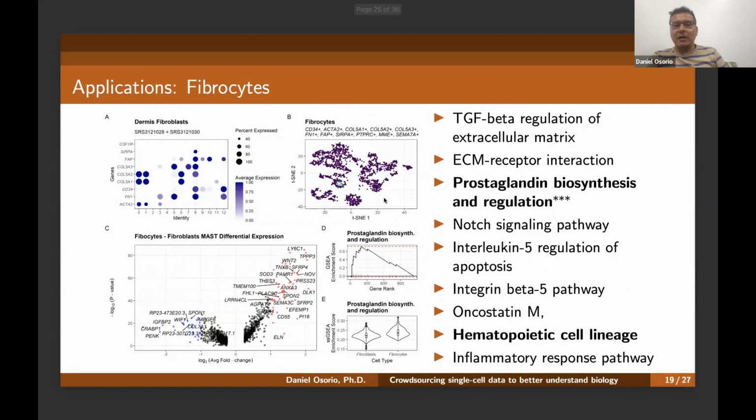And what we found is that there was a cluster, cluster 8, that after pooling the 2 data sets with fibroblasts exhibiting that specific set of genes, is enriched with them. So cluster 8, in comparison with all the other clusters of fibroblasts from skin, is exhibiting the genes I'm interested in. Then to validate that they are actually clustering together, we plotted using the Nebulosa package.